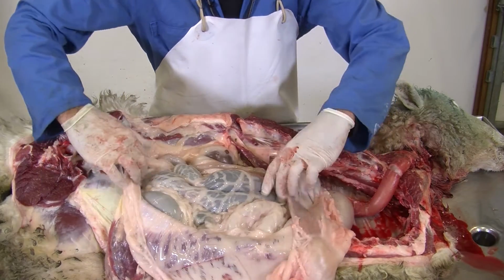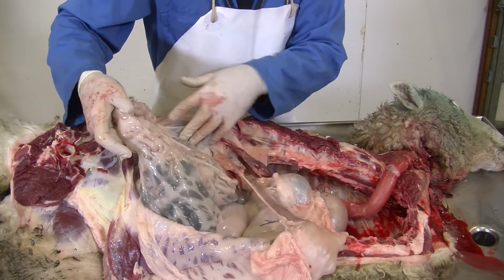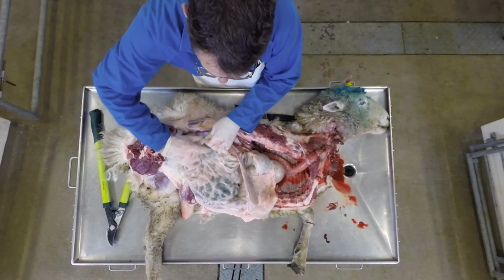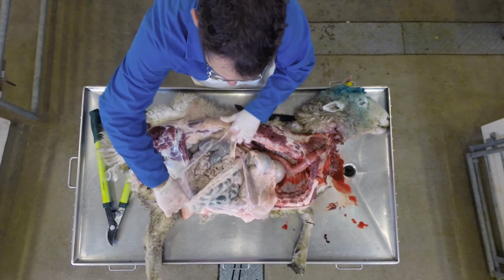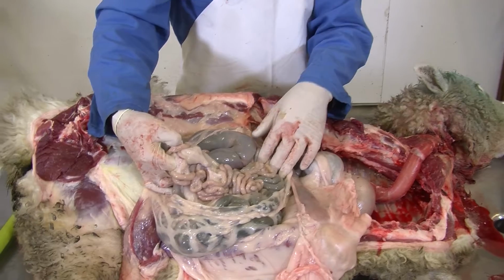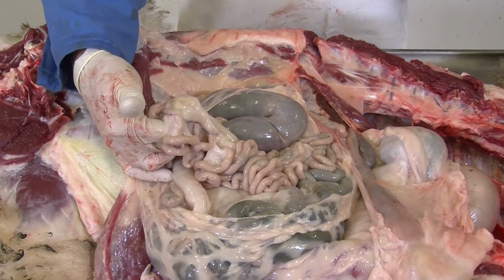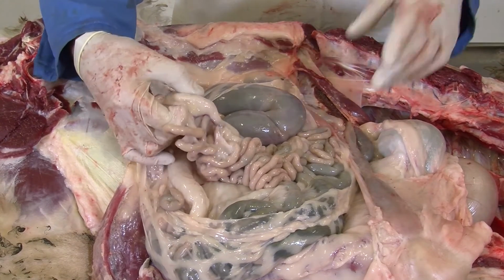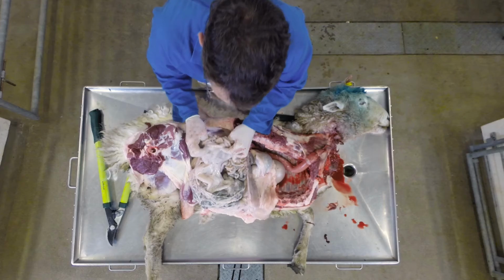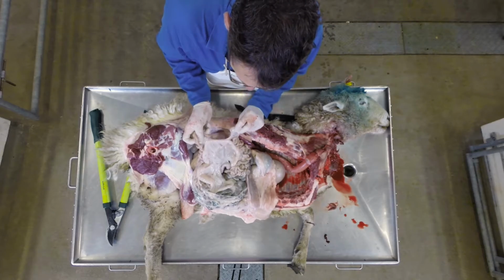So I'll just put that out of the way. And here we have the small intestines. We just go through this omentum. And here we have the small intestine, meters and meters of small intestine. We're going to come back to this in the later part of the lab, but just you can see here how it runs around the edge of a membrane.